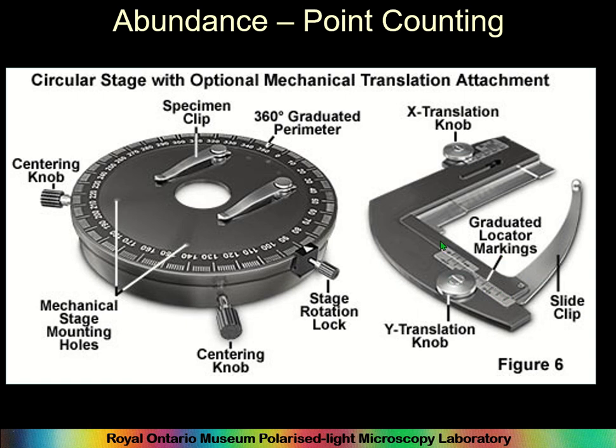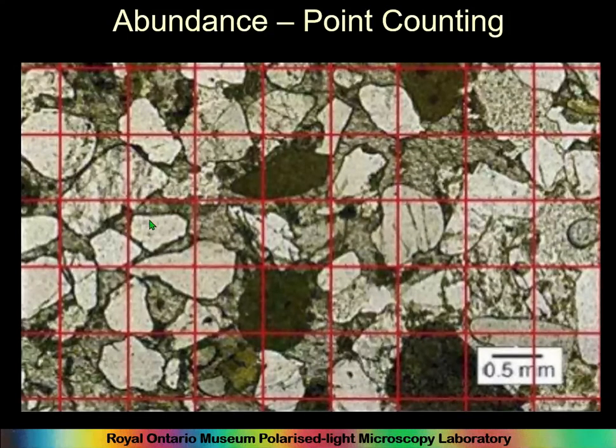So it goes across, and every click you say what is the type of mineral. Here's a quartz, click, there's something else, click, there's something else, click.